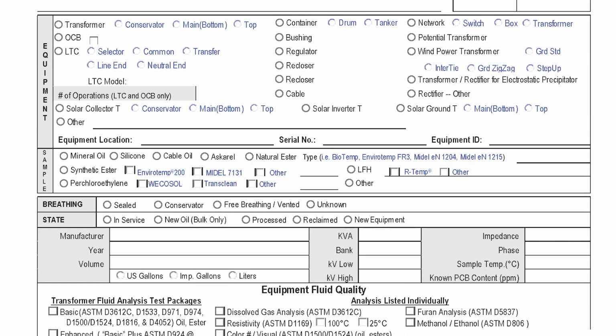If you are sending samples for equipment already created in our system, you only need to add the equipment serial number and information on your sample fluid. We do not change your equipment once the lab has created it in our system.